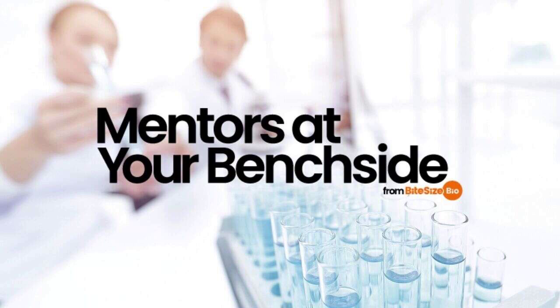If you are using PVDF, remember to activate the blot before transfer, otherwise check the transfer conditions, including the composition of the transfer buffer. Problem number 3. Bands are smeared. A Ponceau S stain should produce crisp, discrete bands. If you see a reddish-pink smear where the bands should be, you may have a problem with your protein.